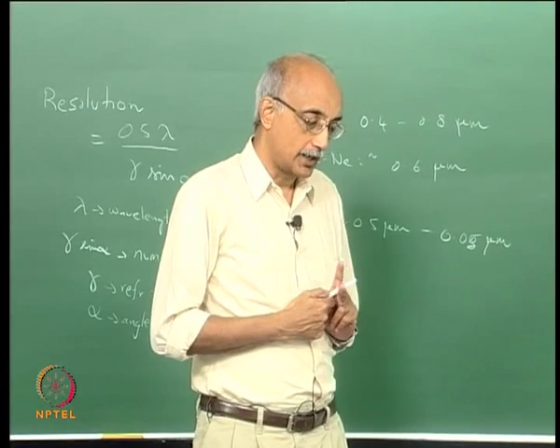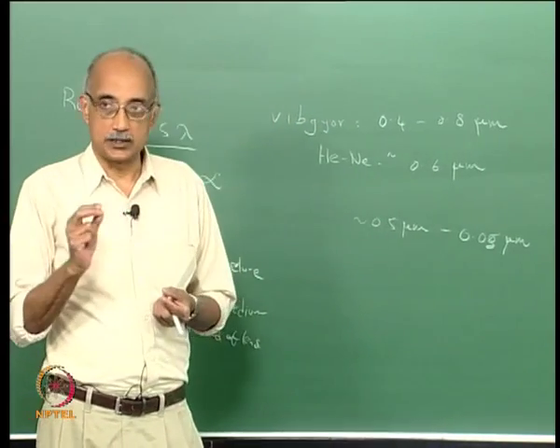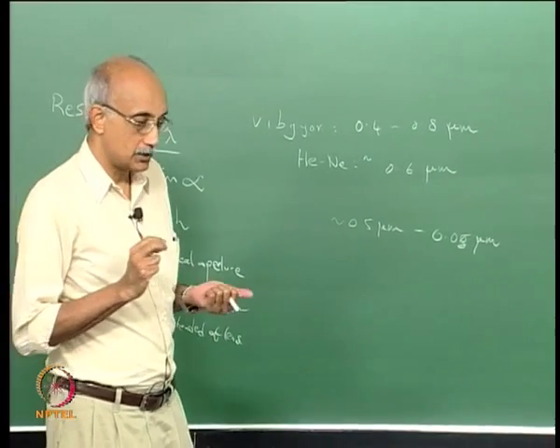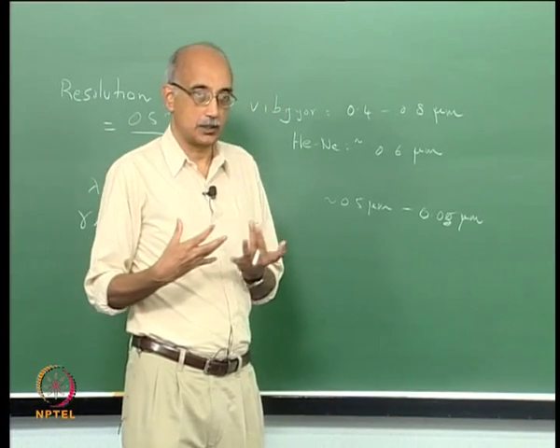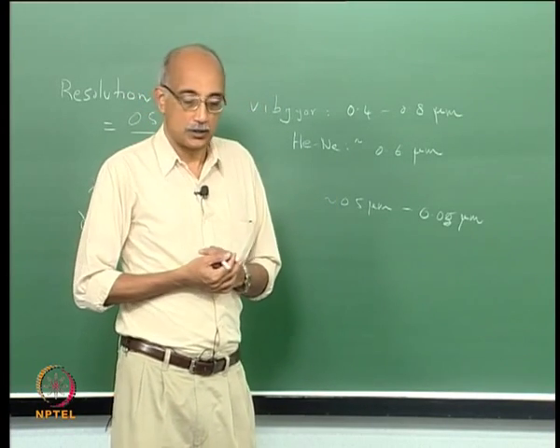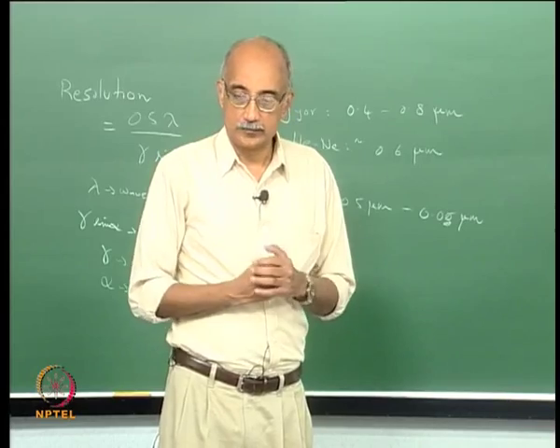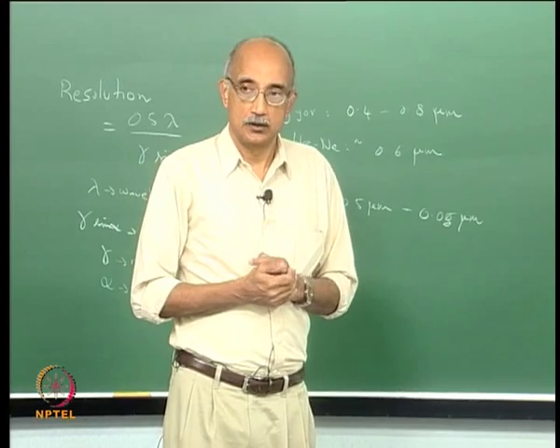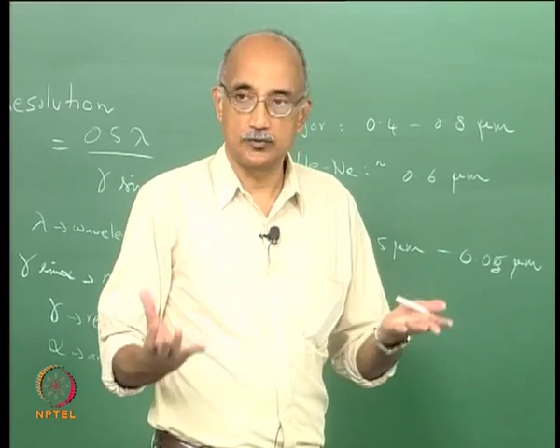Now, when we do again optical microscopy, there are essentially two ways in which microscopy can be done, and that has to do with lighting. I mentioned that resolution is now being improved by looking at other factors that influence the operation of the instrument, and light is certainly one of them. The same surface, if I were to inspect it under, let us say, normal lighting versus suppose I had high intensity lighting, focus lighting, or even oblique angle lighting, would show up particles very differently.